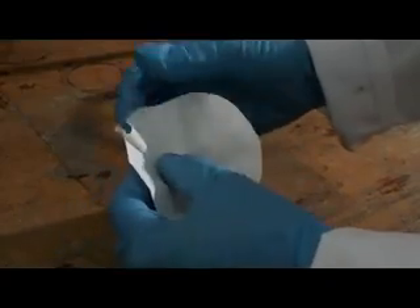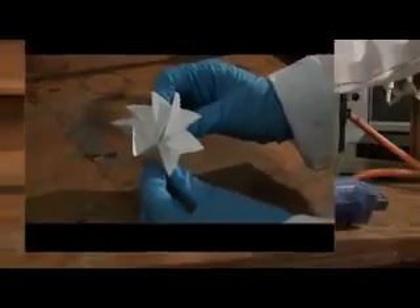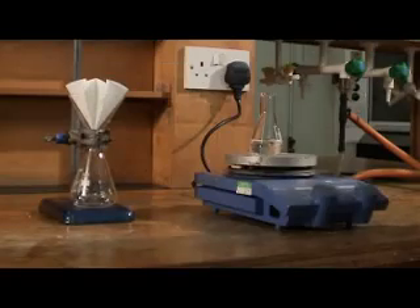Once you've done that, concertina the folds making them nice and crisp. We're using a hot stemless funnel to minimise the amount of compound which crystallises out within the funnel during filtration.